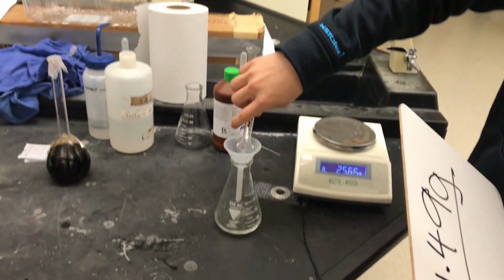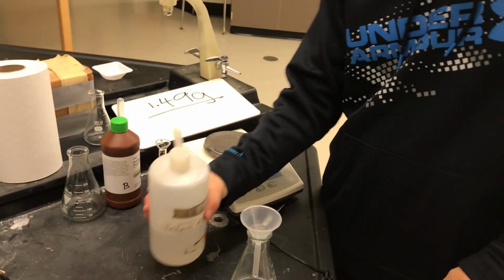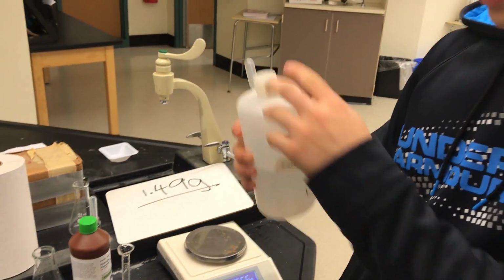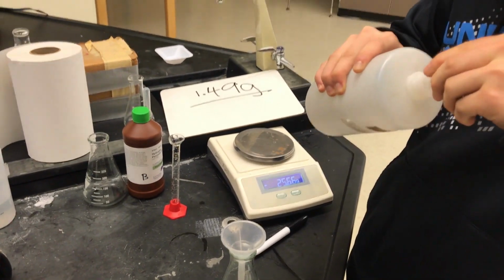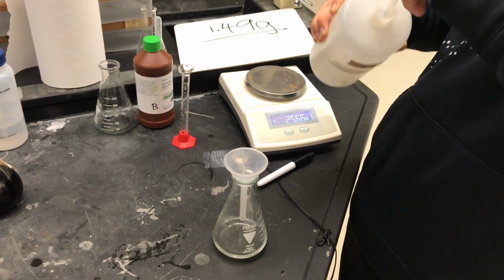Alright, so all you have to do now is pour this into the distilled water. Alright, so all we have to do to complete our solution is use some H2SO4, also known as sulfuric acid, and use a pipette and get a good 2 or 3 squirts into the solution.